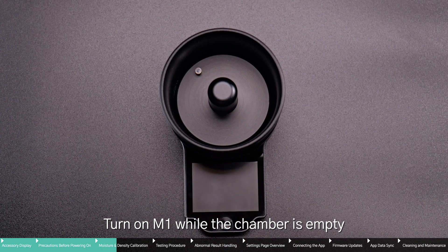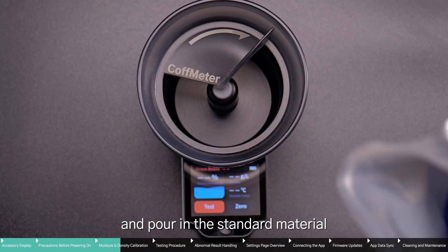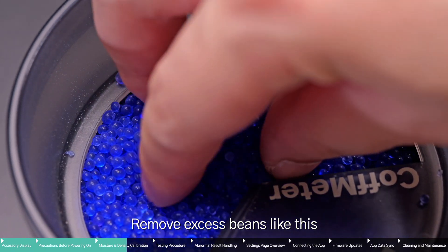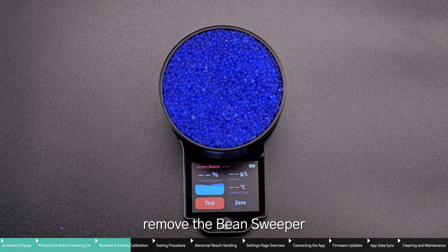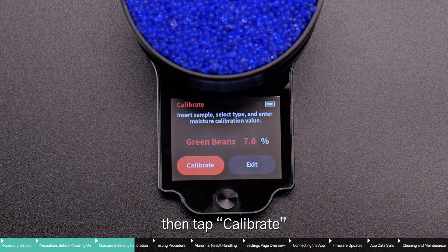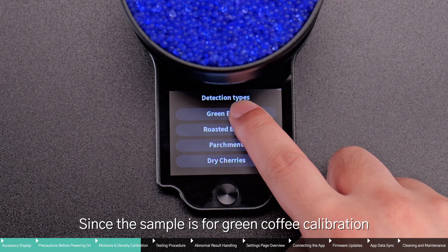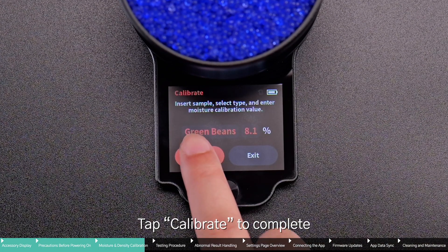Turn on M1 while the chamber is empty. Place the bean sweeper on top and pour in the standard material. Rotate the bean sweeper clockwise to level the sample surface, then remove any excess beans. After leveling, remove the bean sweeper. Swipe from left to right on the screen to open the menu page, then tap Calibrate. Enter the value printed on the calibration material package, select green beans as the calibration type, and tap Calibrate to complete.